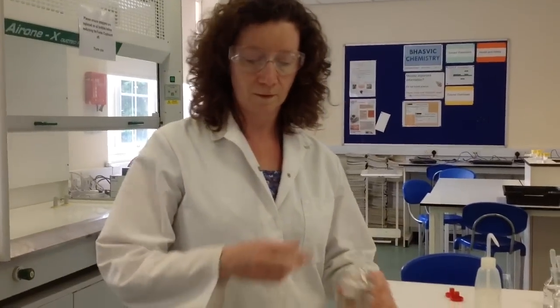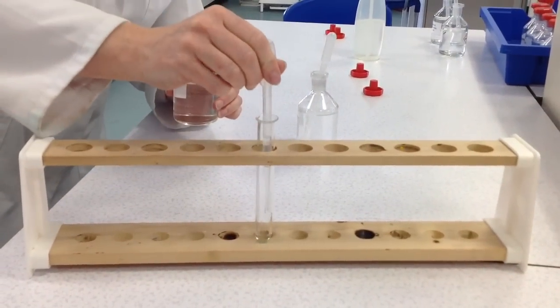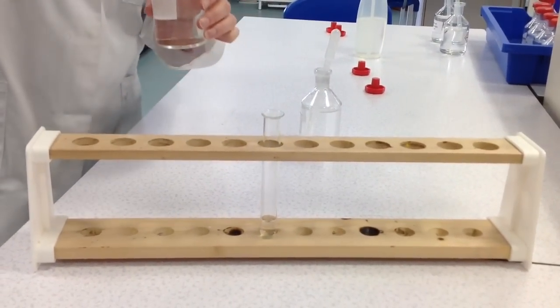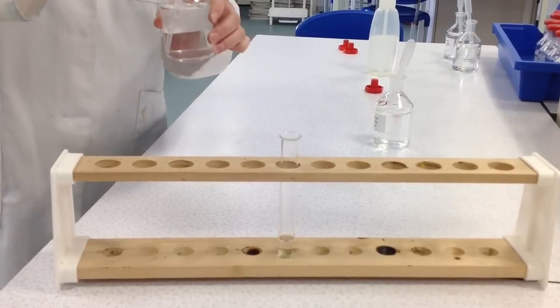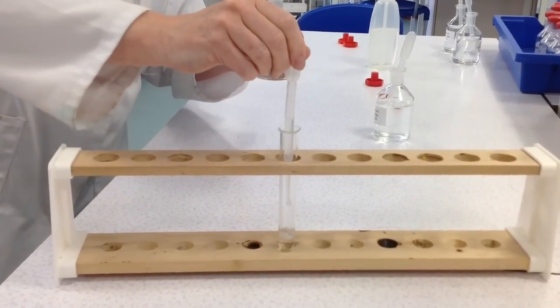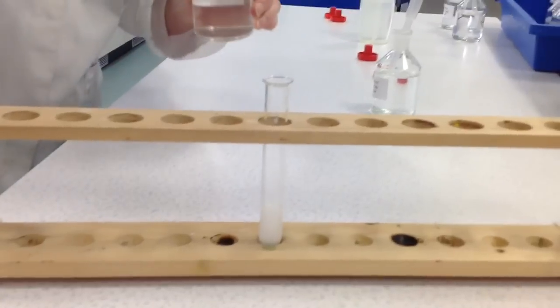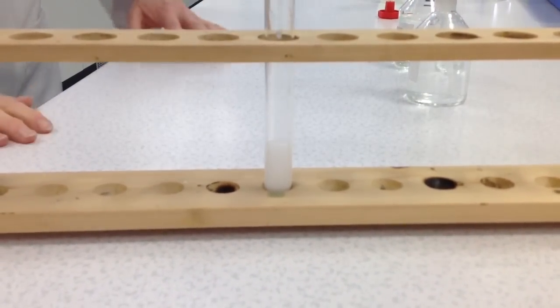Hello. Next I'm going to show you how to test for the sulfate ion. I'm going to put a little bit of sodium sulfate in my test tube. And then I'm going to add some barium nitrate. As you can see, we get a nice white precipitate of barium sulfate appearing.